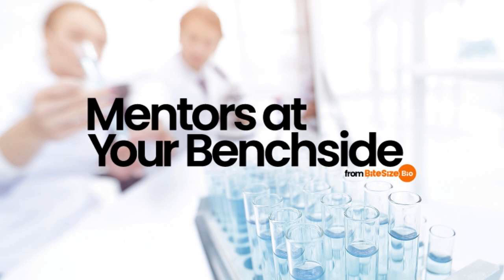Viability stains such as trypan blue. Viability stains like trypan blue differentiate live cells from dead ones based on membrane integrity. Dead cells absorb the stain and appear blue under a microscope, making this method useful for basic viability assessments, but is limited in specificity.